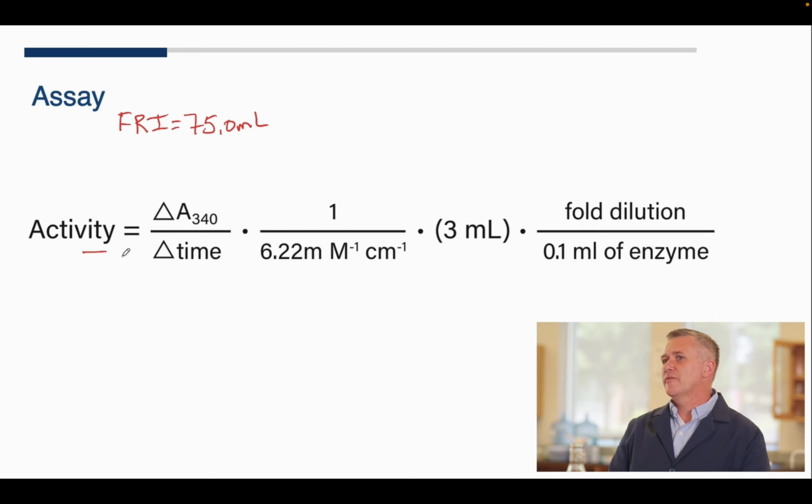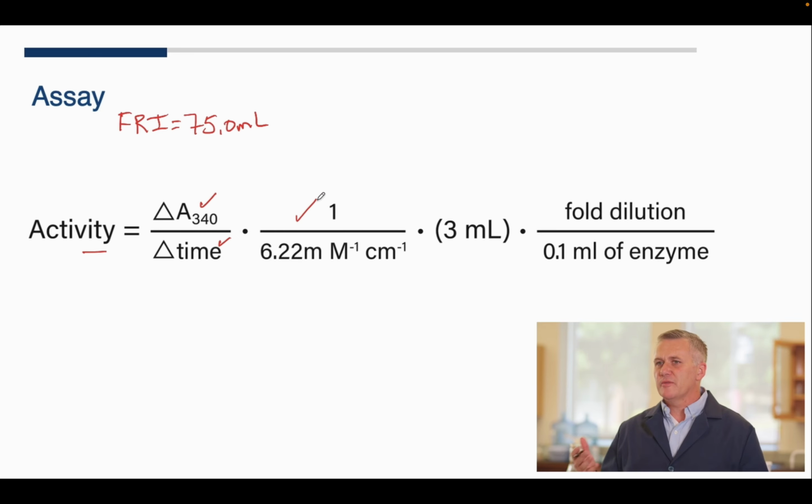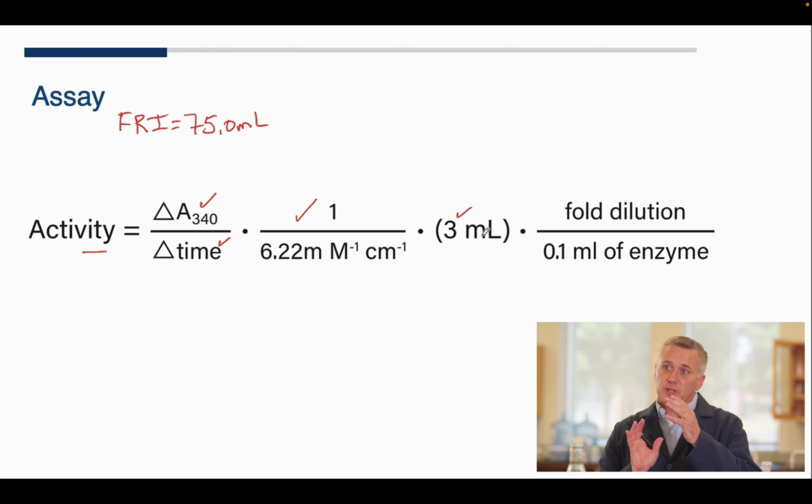And so in order to measure the activity using the spectrophotometer, this is the calculation we do. We look at that change in absorbance at 340, and we talked about that, over 4 minutes. Again, this is an extinction coefficient, so this is important for correcting for that absorbance and the concentration. Our total solution was 3 milliliters, so we had 2.5 milliliters of buffer. All right, so 0.1 milliliters of malate dehydrogenase, 0.1 milliliters of our GOT, 0.1 milliliters of NADH, and 0.2 milliliters of alpha-ketoglutarate to make up a total of 3 milliliters.